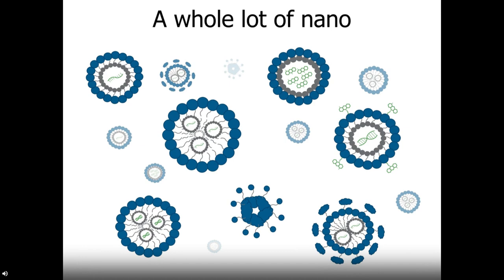Nanoparticles are booming, and they come in a lot of different forms. Liposomes, lipid nanoparticles, solid lipid nanoparticles, lipid nanoemulsions, polymeric nanocarriers, and many, many more. Particles with their own unique tweak and proprietary content for many different applications. In gene therapy, for example, but also cancer treatment, vaccine development, and other biopharma. One of the reasons for this abundance of options is the fact that a variety of payloads can be encapsulated. Of course, making nanomedicine an option in a lot of areas.